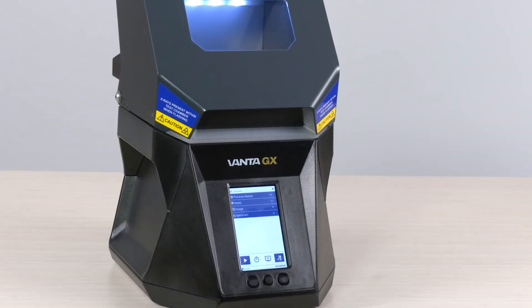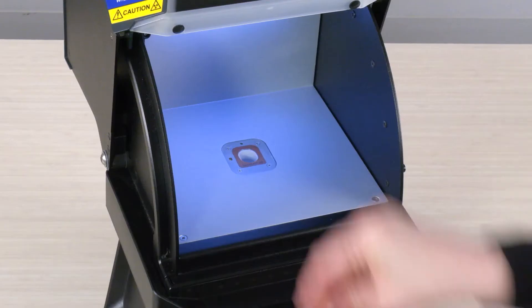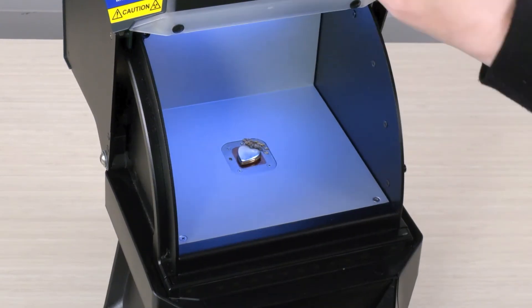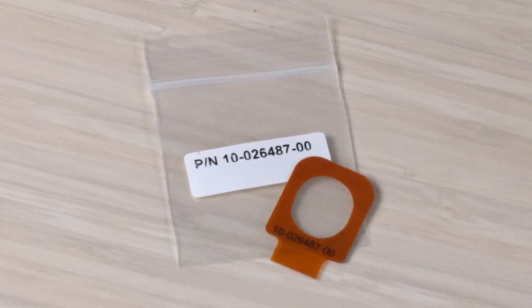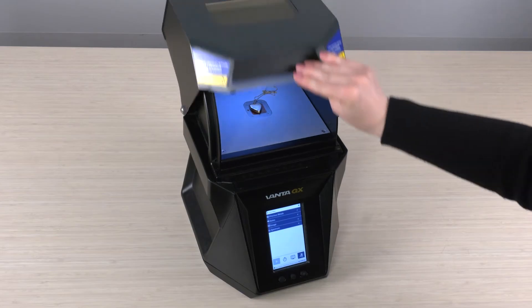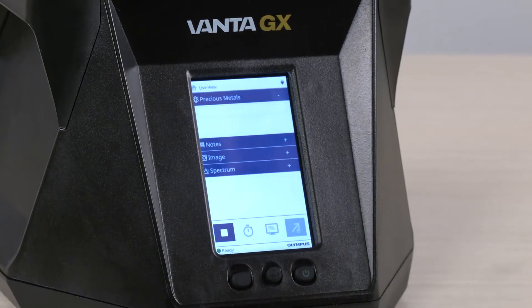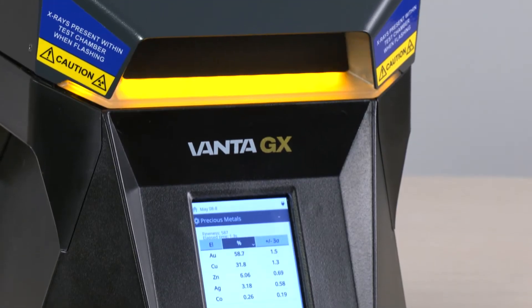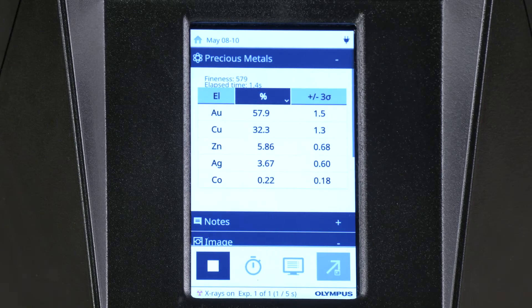Let's test an item. Lift the lid to open the test chamber and place the item on the measurement window. If the measurement window is dirty or damaged, replace it before starting a test. To start a test, close the lid and press the play button. The flashing lights indicate a test is in process. Results appear on the screen in seconds.